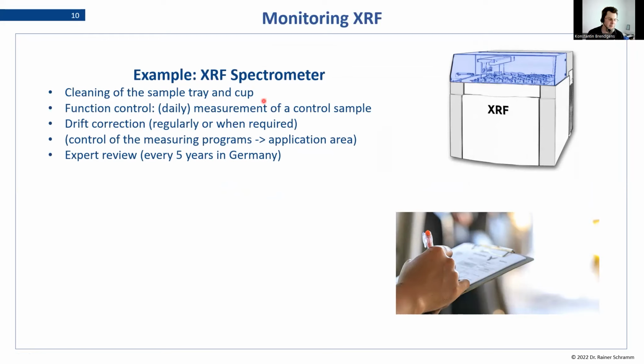You would be surprised how often I've seen at laboratories outside when I was doing service work, just a dusty sample cup or a cassette, basically. So, which is clear, you know, if you're working, for example, with pressed pellets and you measure a lot of samples over the day, they all come into the same cassette or the same cup that goes then inside your spectrometer, for example.